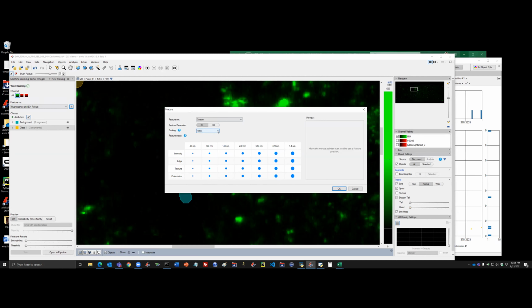Once the objects are exported, we can calculate a lot of values in them, we can create a labeled image or a mask. But I remember that regarding the export, we can export the training as a Zeiss proprietary file format, but we can import trainings which were created in Elastic, from a certain version of the Elastic software. So we can bring them in.